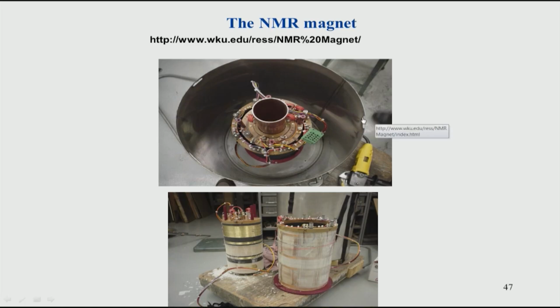And then around this particular container you fill one more container which has a vacuum, so that this liquid helium which is inside does not evaporate, because we want the liquid helium to stay there and not evaporate very rapidly. Therefore, we surround it by a vacuum, and then also we surround it by liquid nitrogen, which is another layer of dewar around this. The liquid nitrogen helps in reducing the evaporation rate of liquid helium, and then again you have a vacuum and so on. So, you have different concentric layers to prevent the liquid helium inside the innermost container from evaporating, but of course one cannot avoid evaporation.